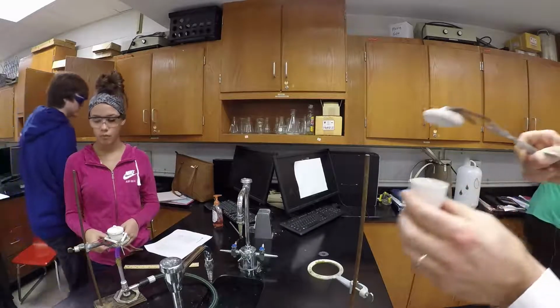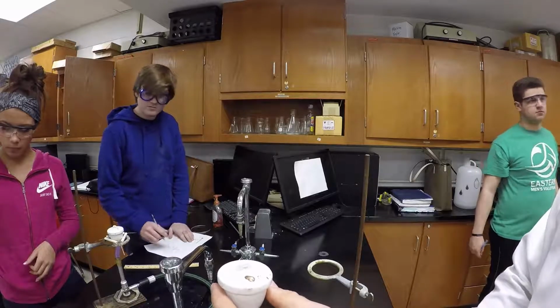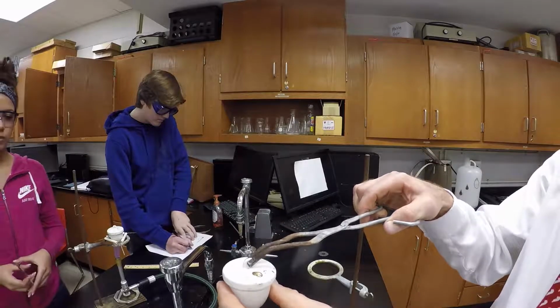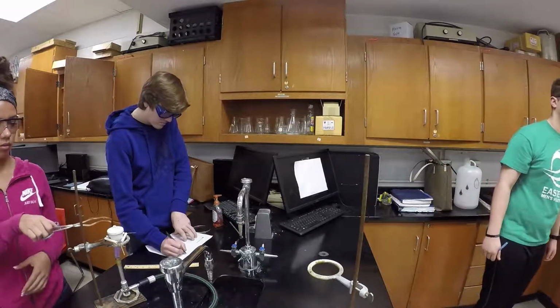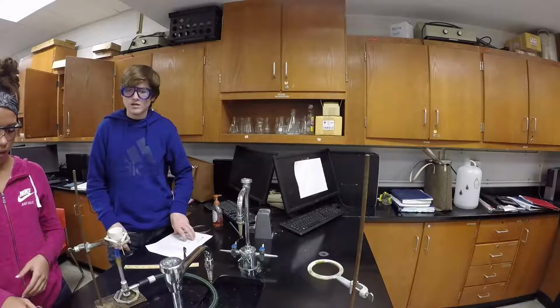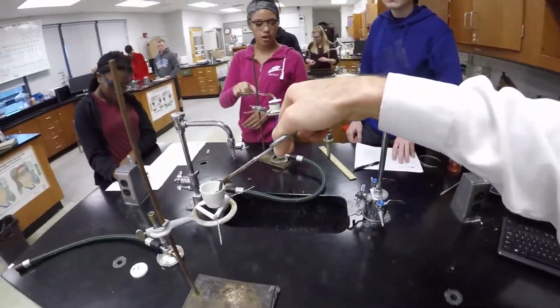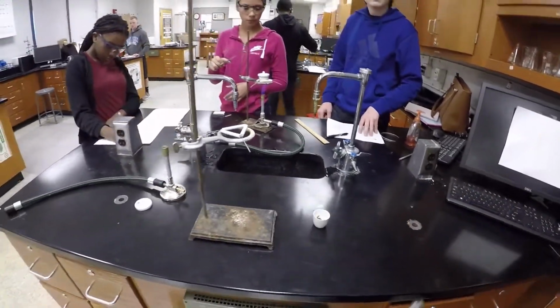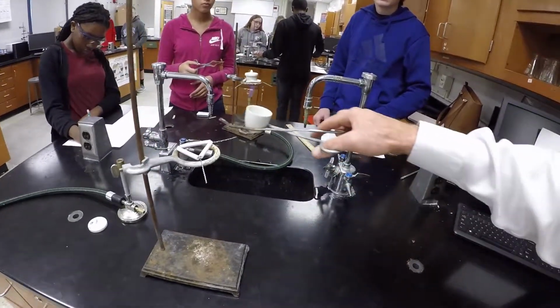It's pretty simple. Now, to move the crucible when it's hot, you're going to let it cool. What I do, like if this is sitting on the ring stand, take the top off, and then I grab it like this. Does everybody see this? I grab it like this. So if it's on the ring, like this, right here, I'm just going to grab it, and I'm going to take it to the table and let it cool. Now, some people like to do it this way. Put it on a paper towel. Well, you're going to let it cool first. You put it on paper towel, it could catch on fire.